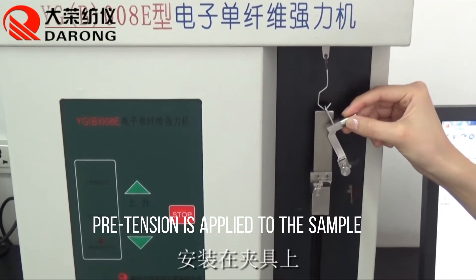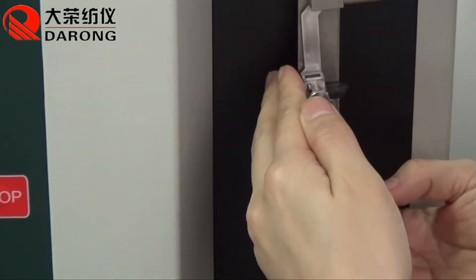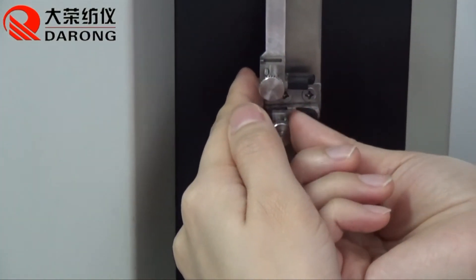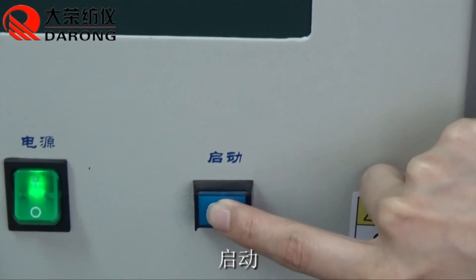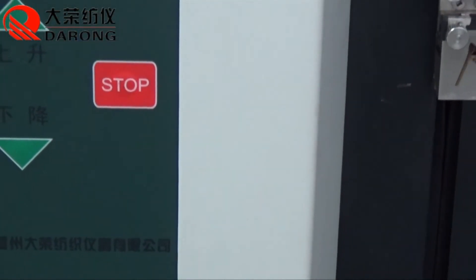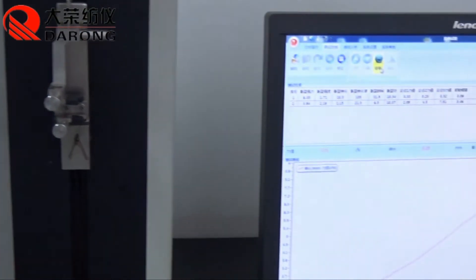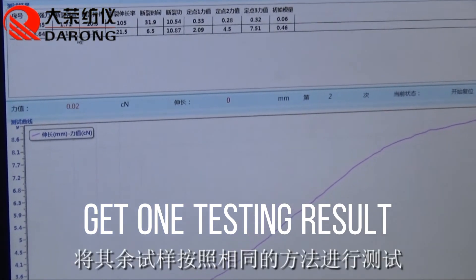Pre-tension is applied to the sample. Press Start. One testing result is obtained.